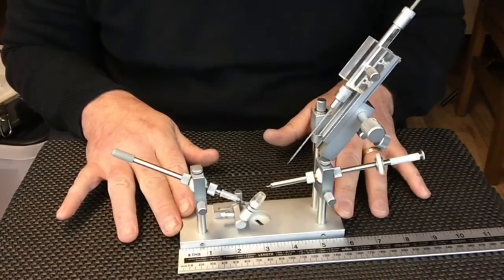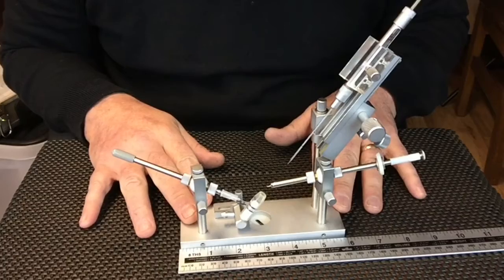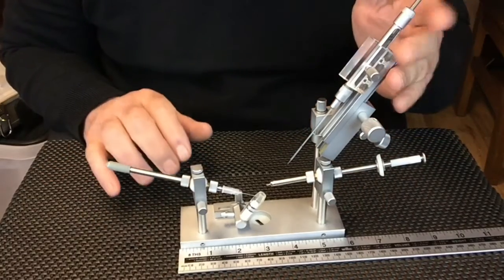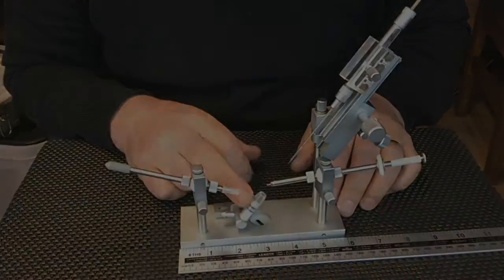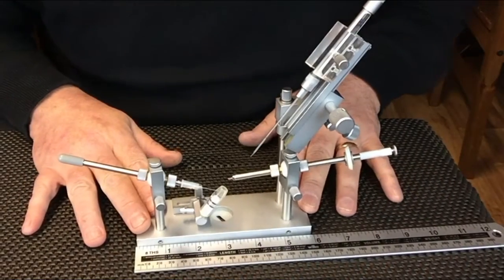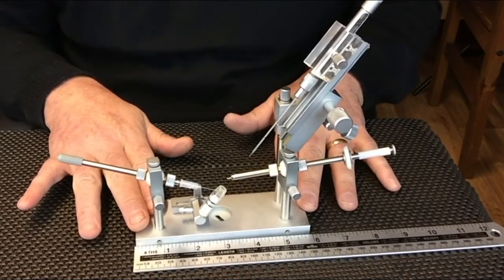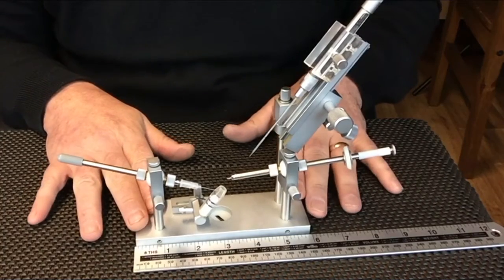The insemination instrument consists of a base supporting the hooks and the syringe and holder and the queen holder at the front. The base measures approximately five and three quarter inches and is made to be attached to a solid base or the base of a microscope.